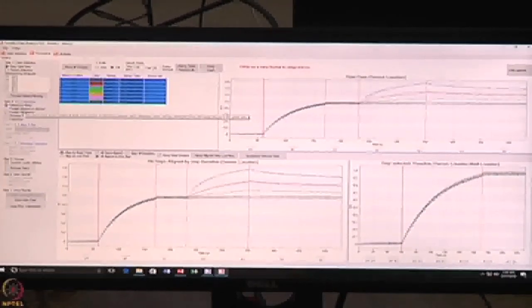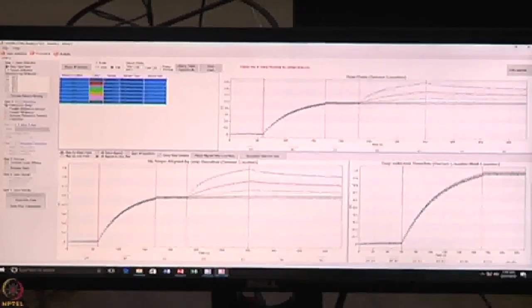We have different referencings. We call it parallel referencing, then double referencing and all. Depending upon the experiment, sometimes you find non-specific binding. That time you have to go for the double reference or the parallel reference. But for this experiment, prior to setting up any experiment, take a single sensor and dip it into the analyte. No immobilization, nothing. When you dip into the analyte, your analyte should not interact with the sensor. That indicates that there is no non-specific binding.